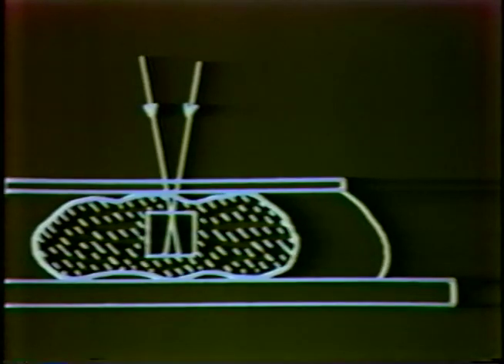You can do any other image manipulation. Here is, in fact, an image taken with the old Czech microscope, which, as you've probably noticed, gives rise to strong curved lines which are not present in the new Tracor microscope, with the curved lines, which have a particular spatial frequency, removed by making a two-dimensional fast Fourier transform, then putting a filter on that and a back transform, and we've removed the scanning lines. The same Fourier manipulations can be used to determine spatial frequencies, so we can measure the size of those features that we saw in that previous image.